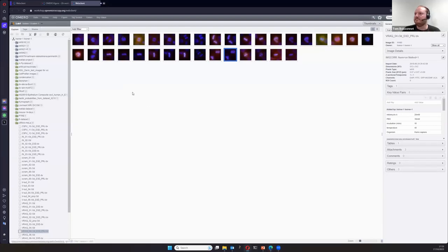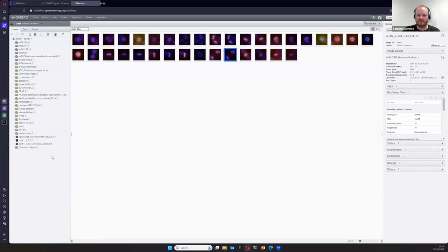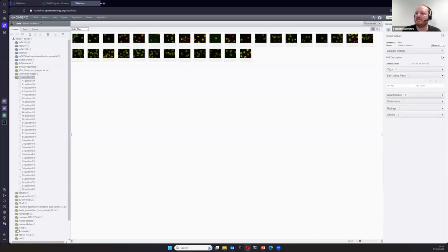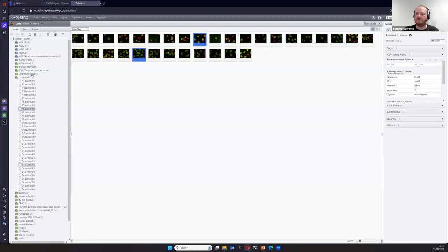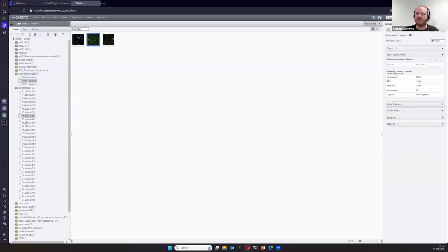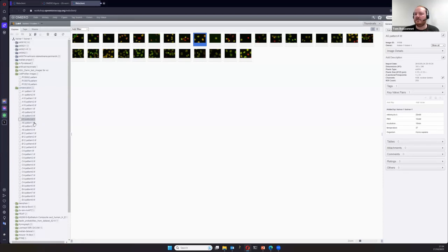If you are logged into OMERO, you can choose a dataset from the list available. You may not have exactly the same datasets as I do, but you should also have the condensation dataset — you could select that one. Select an image of your choice, or even several images from several datasets if you want. Then right-click and open with OMERO Figure, which will open the OMERO Figure plugin.